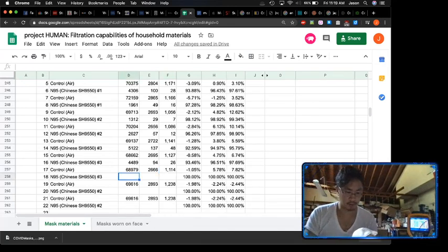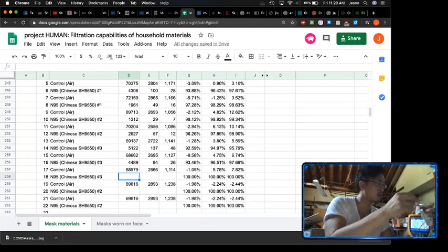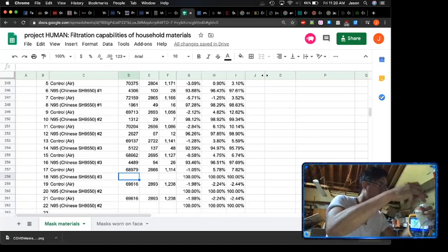Doing a third run for this one just because both these runs were really bad. I just want to make sure there's no variability in the samples. So again, I'm going to put it in a different area. It's so stiff, it's just super hard.